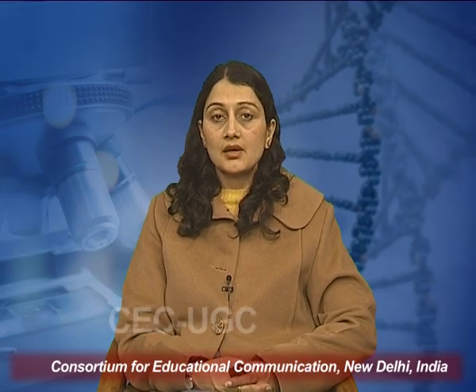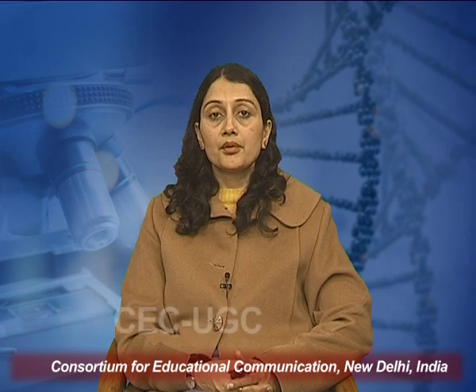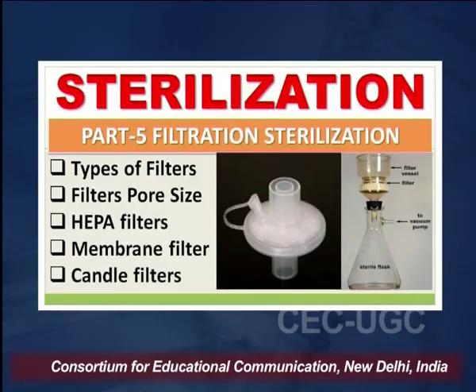Now, let us move to the other part of the sterilization techniques, the physical method of filtration sterilization. Once you know that no other kind of sterilization can be done on your culture, like heat sterilization, because you have proteins which will be broken down because of the heat, or chemical sterilization, because the chemicals can affect your culture, then you use filter sterilization. There are different types of filters based upon their pore size. The pore size can vary from 0.2 micrometer to 10 micrometer.